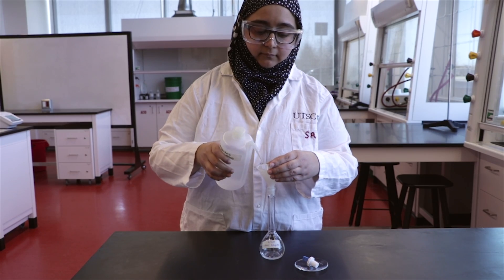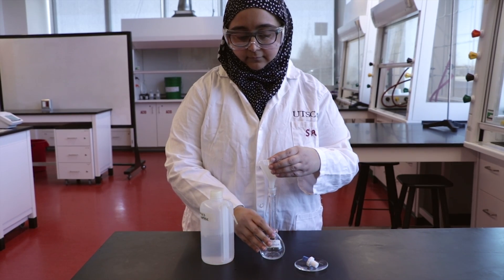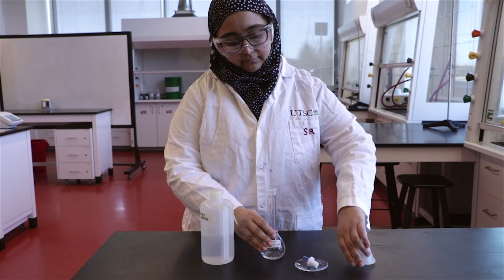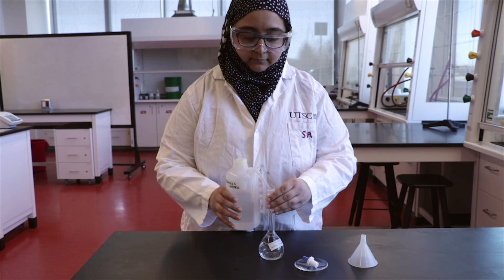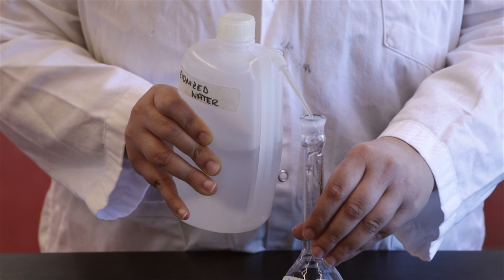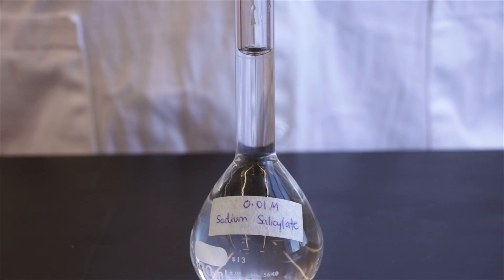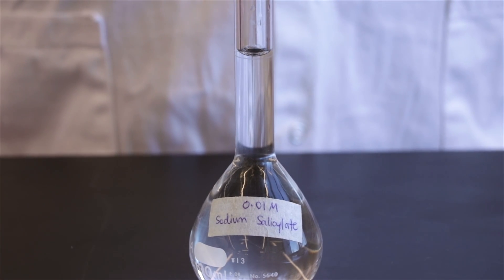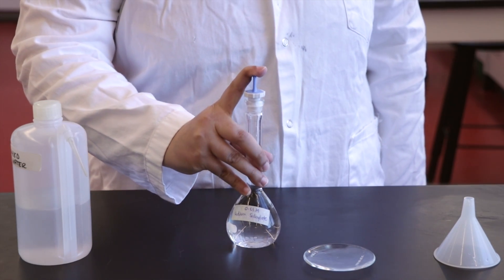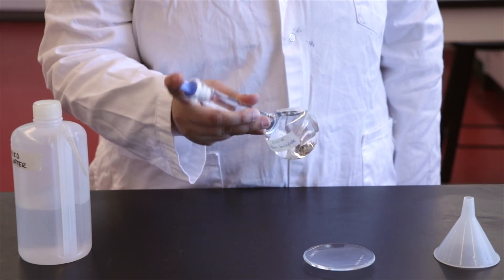Rinse the funnel with distilled water to wash down any powder adhering to the sides and fill the volumetric flask to the mark. Once the solution reaches the bottom of the neck of the flask, use a dropper to accurately fill to the mark. Invert the solution 20 times before proceeding to the next step.